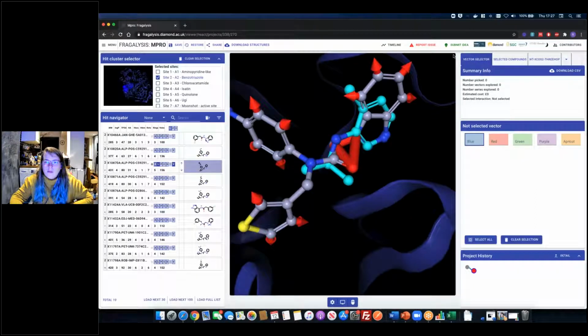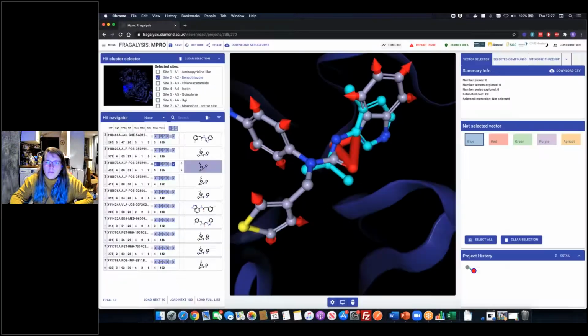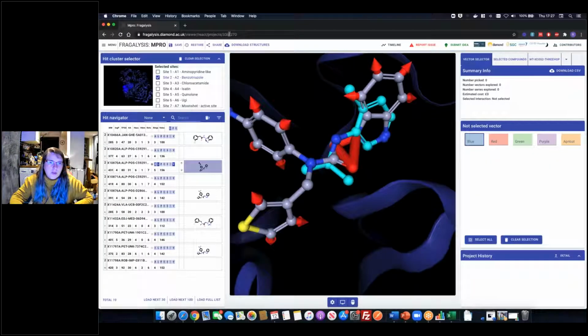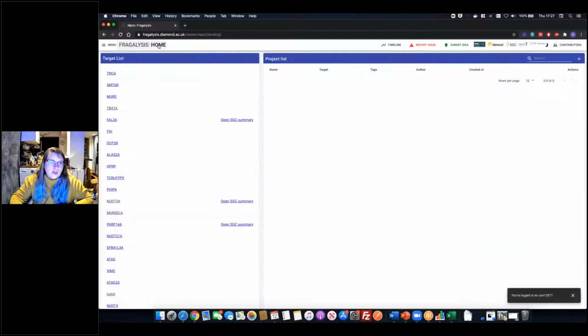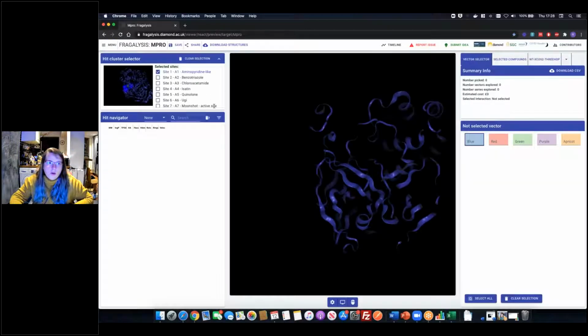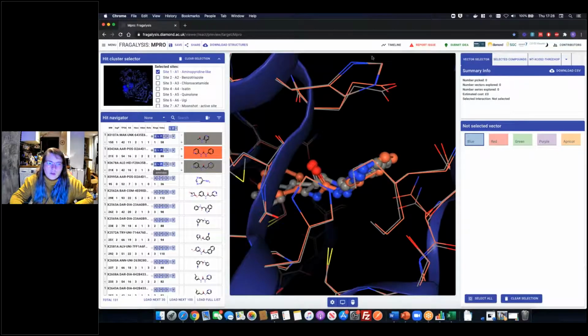Okay. Another interesting thing you can look at as well is the timeline up here. That works well. So if I refresh the page and do some new stuff, let's see if this works. It's because I'm on a project. So let's go from the beginning on MPro. Turn a few things on.